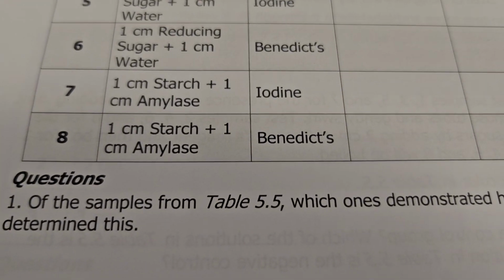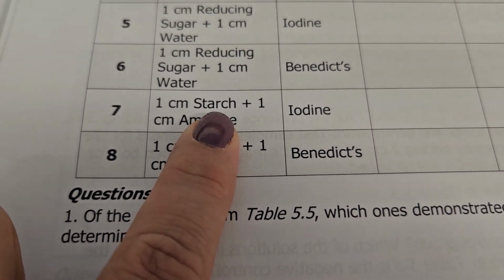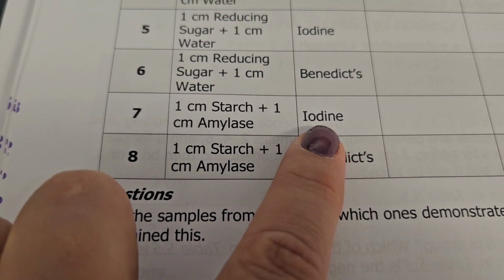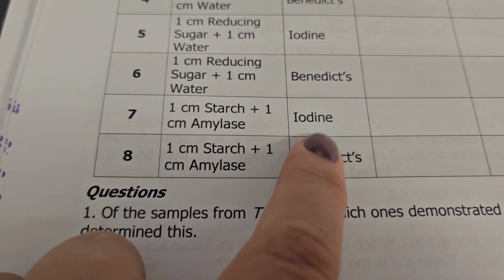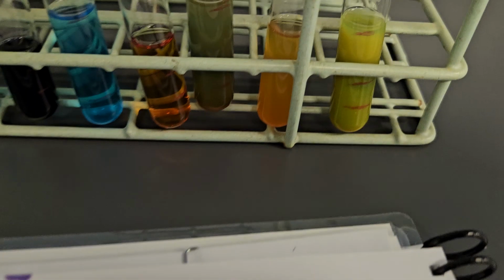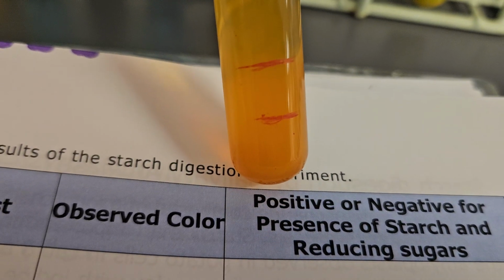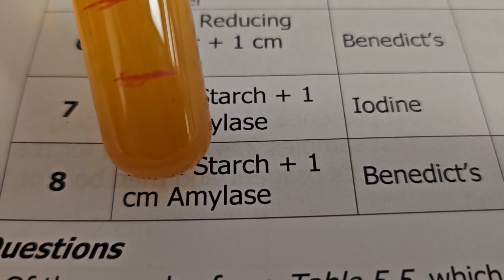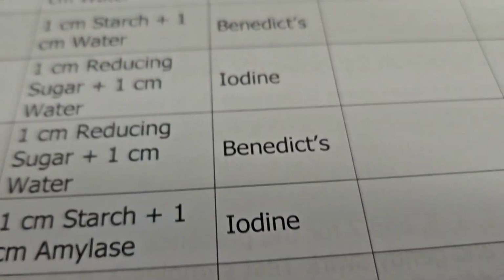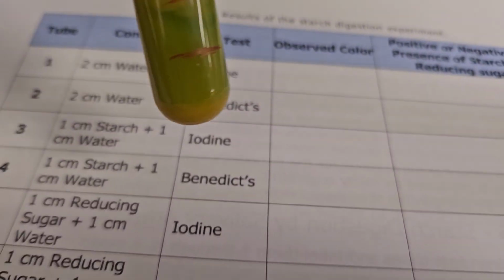But with test tubes 7 and 8, we gave the enzyme starch, and after 15-20 minutes, we tested it with iodine and then Benedict's. It's the same thing, we're just doing 2 different tests. What happened here is we had a negative test for iodine, which means there was no starch left. So we started with starch and amylase in number 7, and we ended with none. No starch was left.